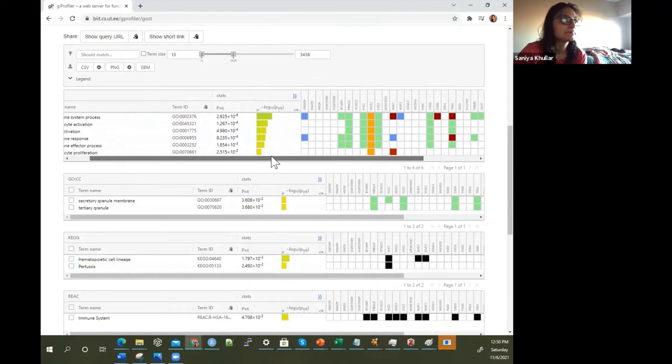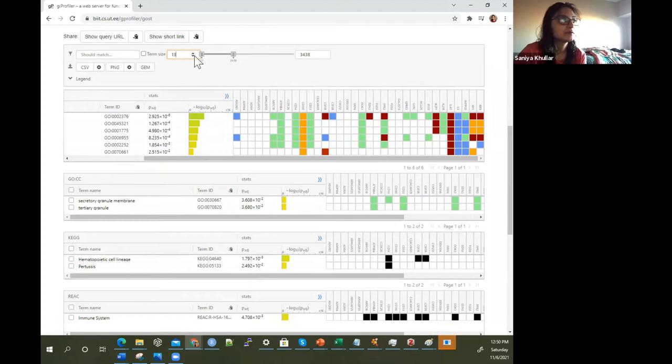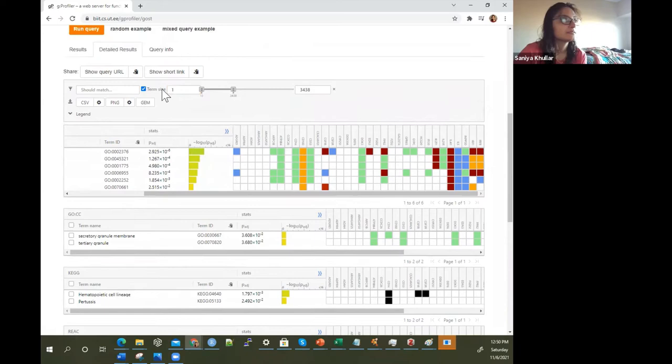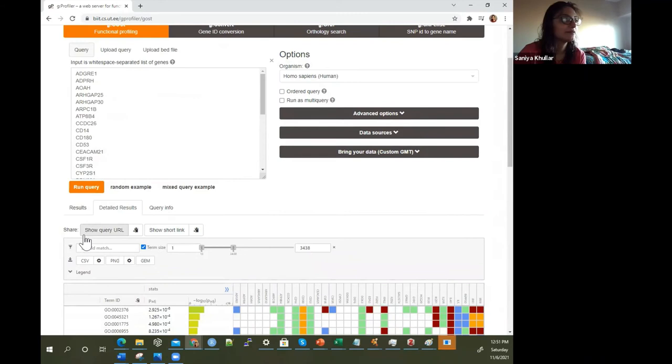You could also do some additional filters as well. These are some analyses you can do here, and you can download this as well.